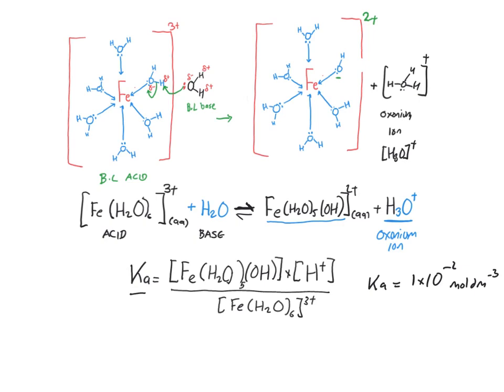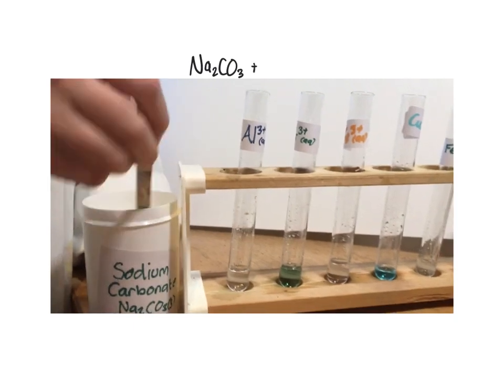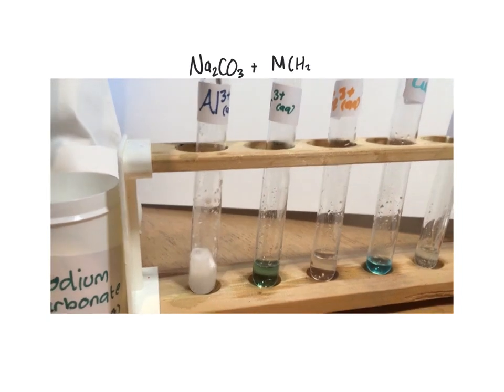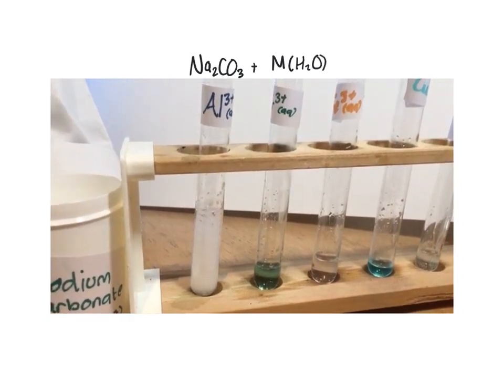So let's have a look at different bases other than water molecules. In this experiment, we added some solid sodium carbonate to a range of aqueous metal ions, some 3+ ions, and then compared it to some 2+ ions. So here's the reaction when sodium carbonate was added to aqueous aluminium 3+ ions. You can definitely see a lot of effervescence there.